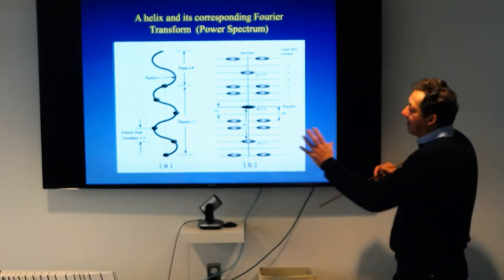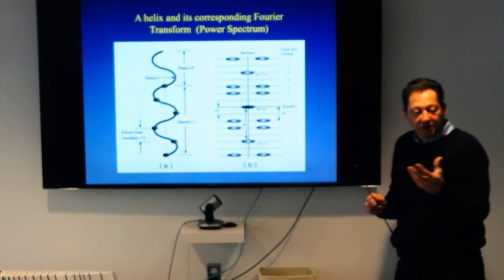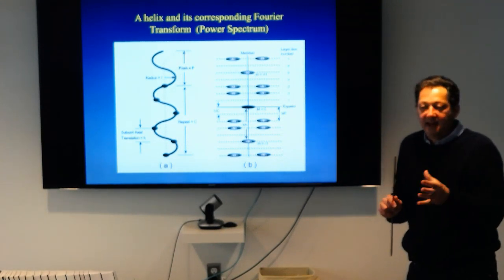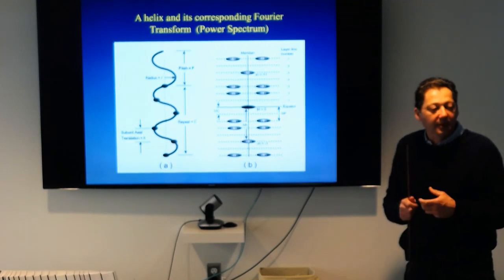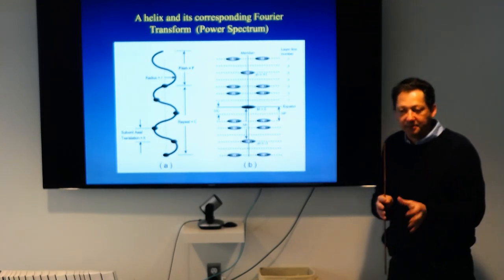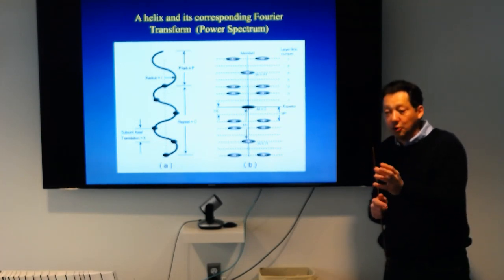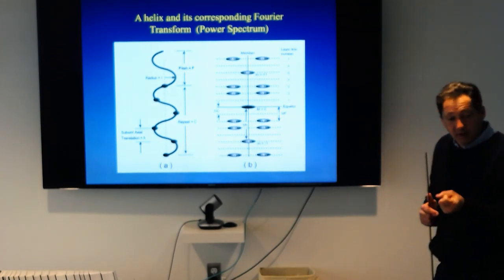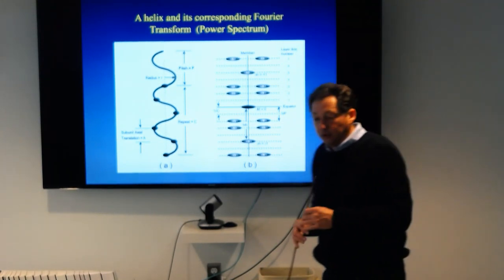Just by looking at this, and that's why I'm starting with the Fourier transform: if you don't have an idea of what type of helix you have, you probably are going to start by looking at this diffraction pattern, because there is a lot of information there about the periodicity that you're going to use to actually determine the spatial parameters that define your helix.